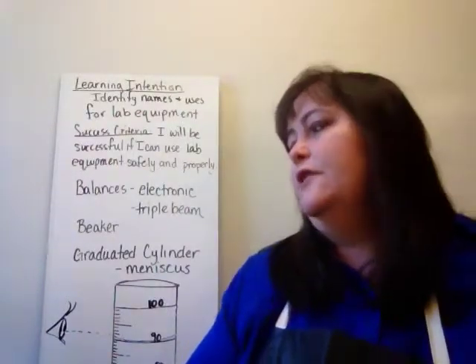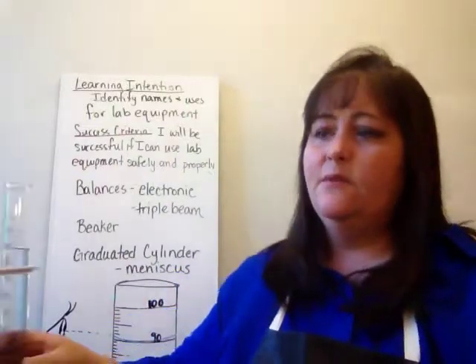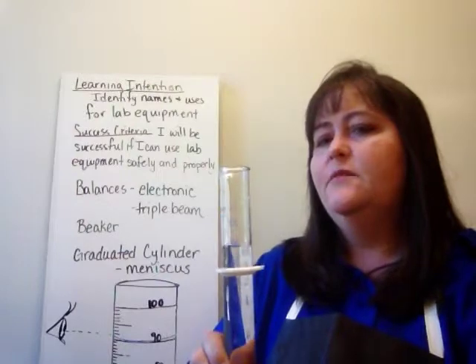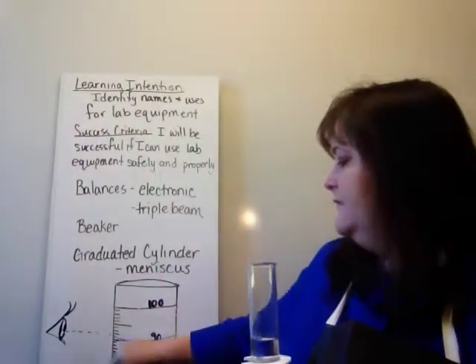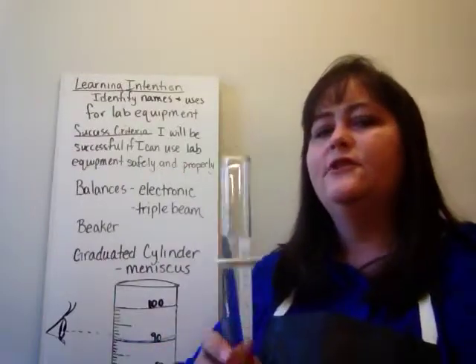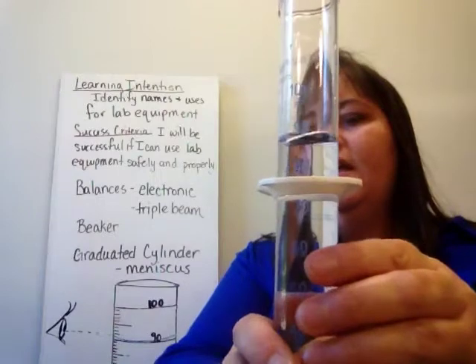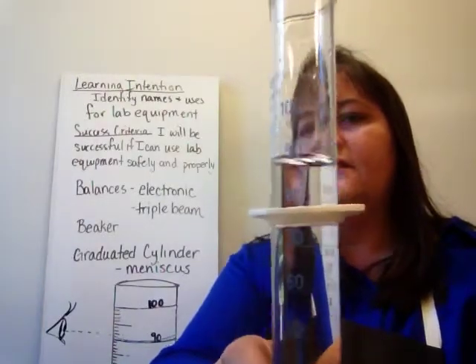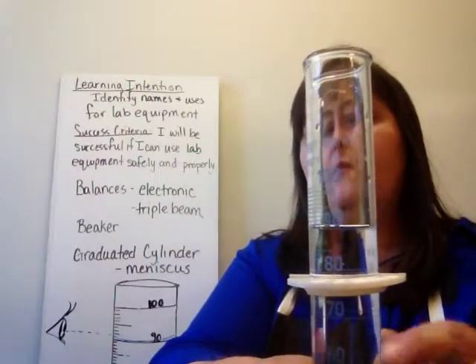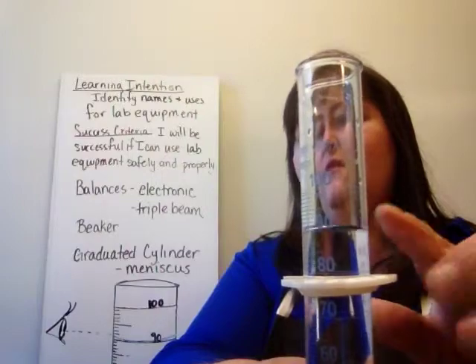The next thing we're going to use is the graduated cylinder. It's a little bit more complicated than the beaker because the graduated cylinder has to be read at the meniscus. Now, you might have already heard about the meniscus. The meniscus is the curved line that is created whenever water is held in a cylindrical container. And if you look very carefully, you may be able to detect the meniscus in this graduated cylinder. It's hard to do on a video, but you can see where the light is reflecting off the water, and it looks sort of funky.